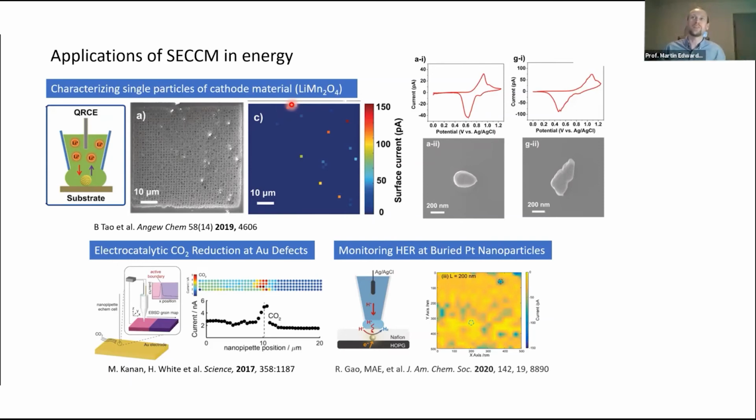Okay, well, that justifies us doing those kinds of measurements, but we've got the SEM, so we can really look at each of these particles and we can do individual electrochemical characterizations at each cathode particle and really understand that there's some variability in the process here.